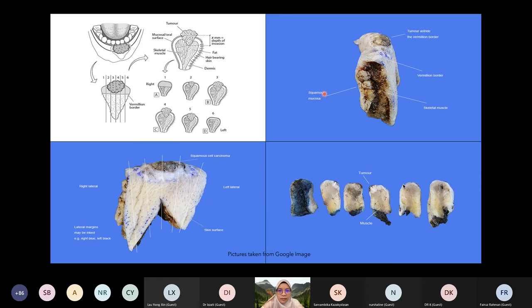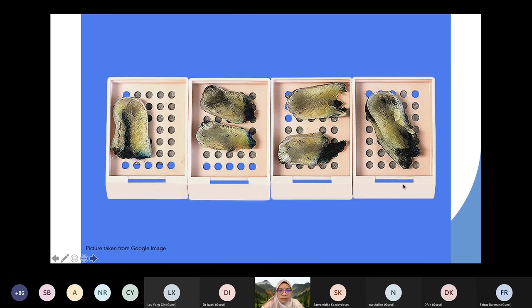Okay, the specimen should be labeled for the surgical margins as well as the right or the left side, because once we receive the tissue, it doesn't have the magician's eye that can see beyond what we have in our hand. Here, the surgical margins from each lateral side will be inked, the deep margin here as well, and the specimens will be sectioned into pieces that are going to fit in the cassettes.